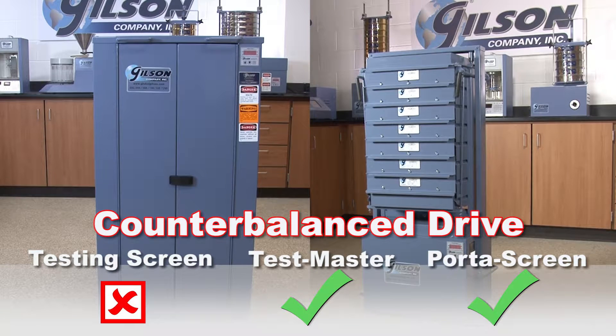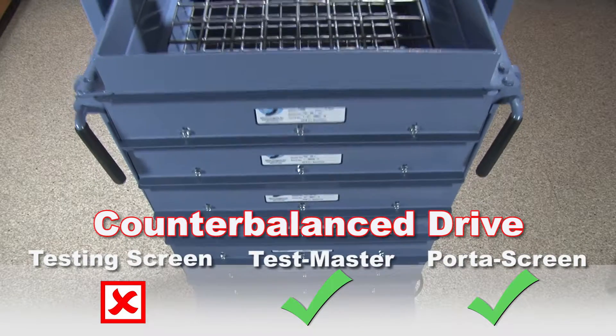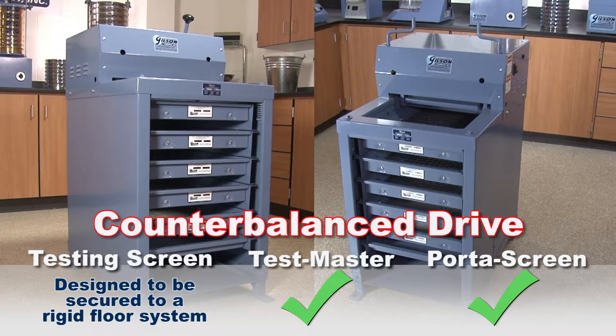Both the Testmaster and Porta screen models have a synchronized rotating counterbalance system for smooth, stable operation with no required mounting. Whereas the testing screen models are designed to be secured with anchor bolts to a rigid floor system such as a concrete slab.